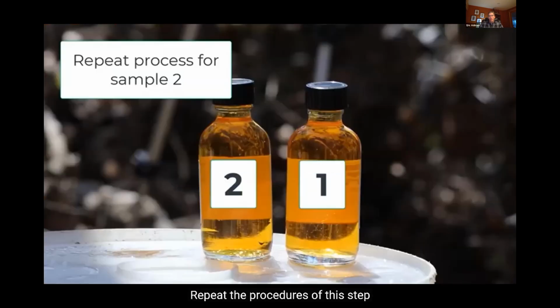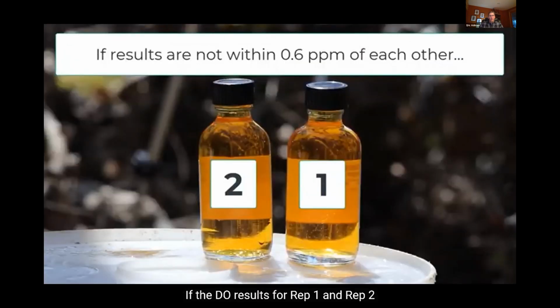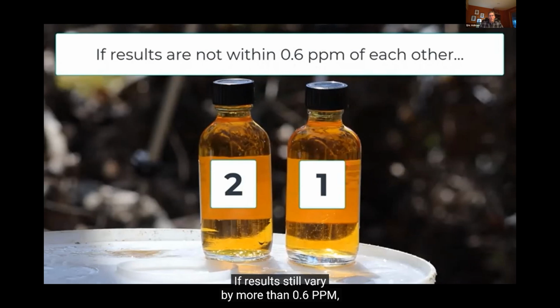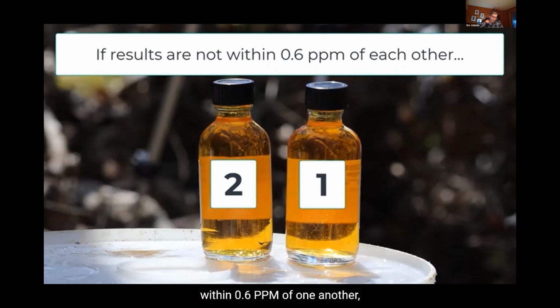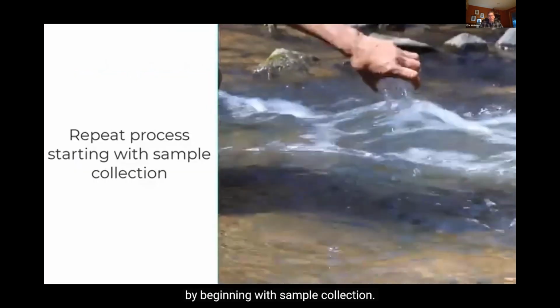Repeat the procedures of this step for the second sample bottle and record the results for rep 2 on the data form. If the DO results for rep 1 and rep 2 are not within 0.6 ppm of each other, repeat the steps for titrating the fixed sample in the first bottle. If results still vary by more than 0.6 ppm, repeat the steps for titrating with the sample in the second bottle. If there are still not two results within 0.6 ppm of one another, you will need to repeat the entire test by beginning with sample collection.